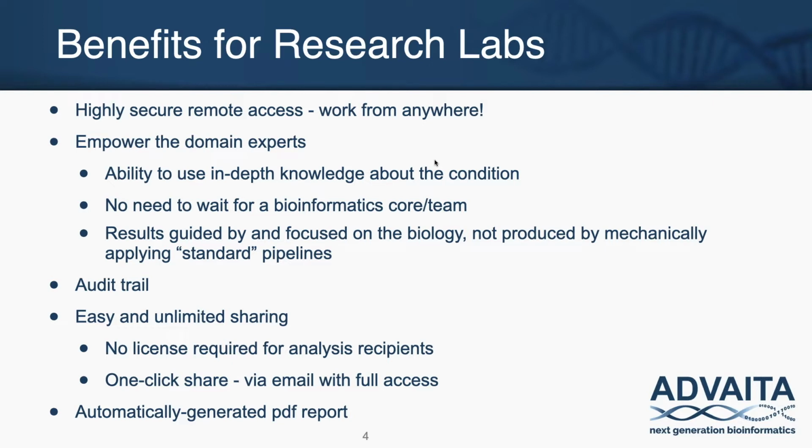And the last thing is there's an automatically generated PDF summary of every analysis. It's a comprehensive 25-page research report. I've seen people use it as supplementary materials. I've seen people use it in the method section of their manuscripts. And it's just a really nice, full featured explainer of the top results from your analysis.